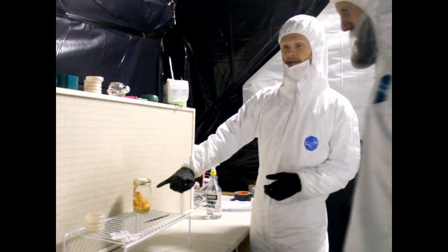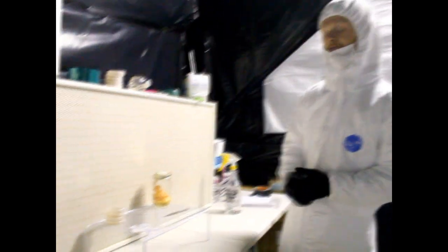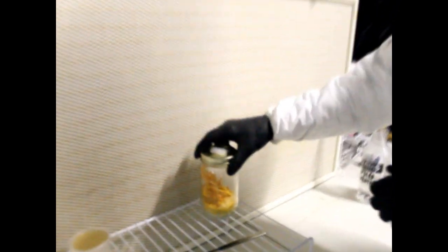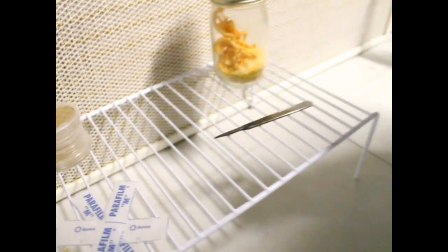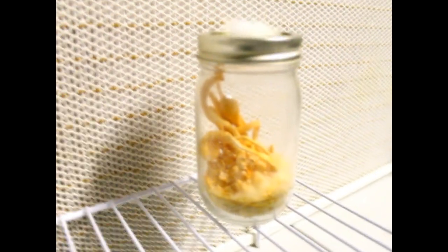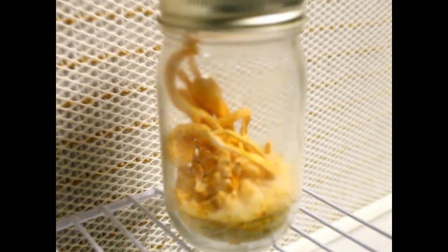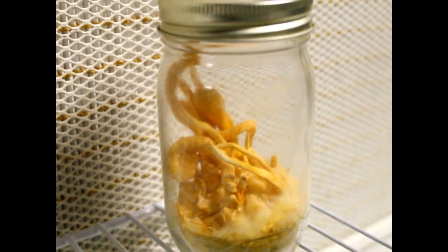Cordyceps militaris have these little bumps on the side of the mushroom, and these are called perithecia. They hold the spores in a sack called the perithecium, and we can scrape off those bumps on the Cordyceps and put them on an agar dish.